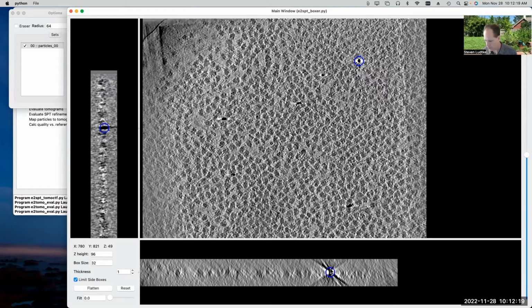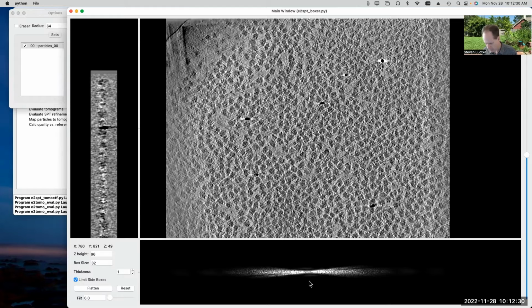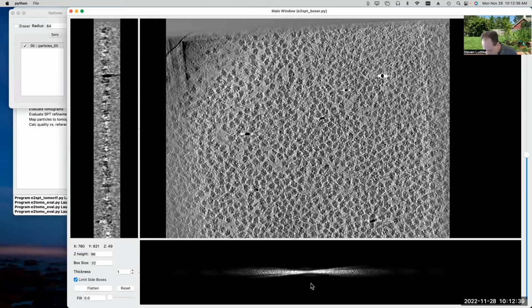Right. So if you look at these gold fiducials, what you'd like to see is that they're somewhat symmetric looking, that the rays that you get off in different directions look okay. If we look in Fourier space, you should actually be able to see the slices of the tilt series in one of these directions. Actually, this is such a thin tomographic reconstruction that the slices are all merged together. You can see the missing wedge up here and down here somewhat, but you can't make out the individual slices here because it's such a thin reconstruction.